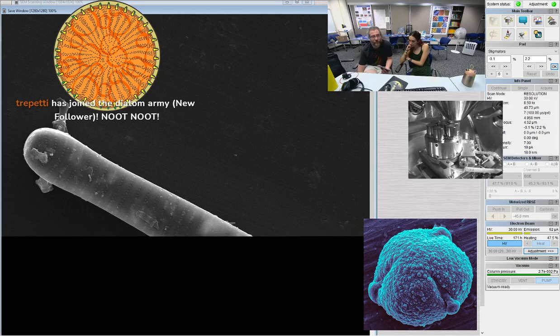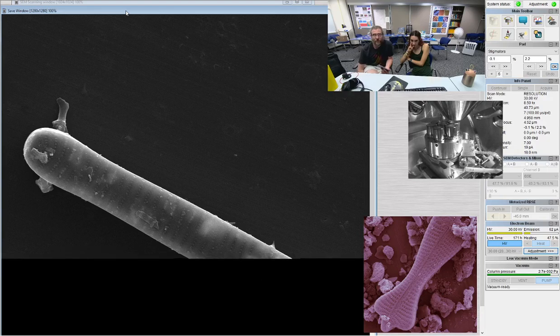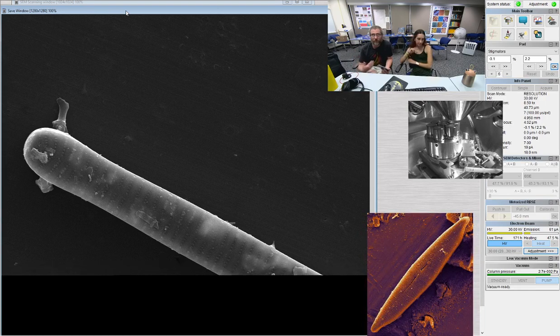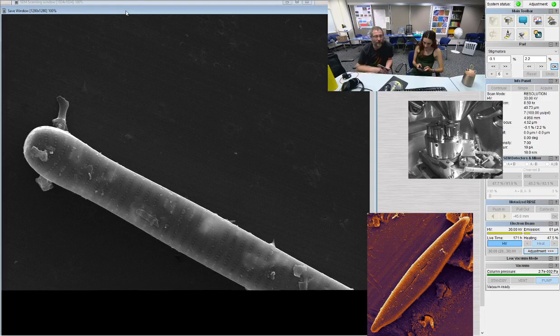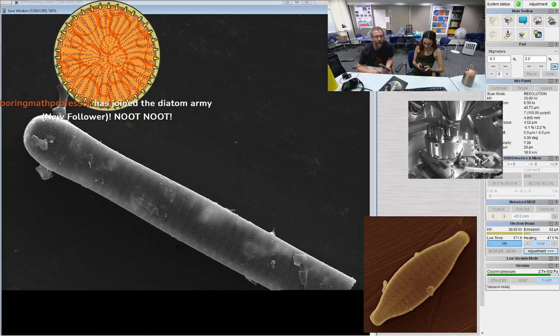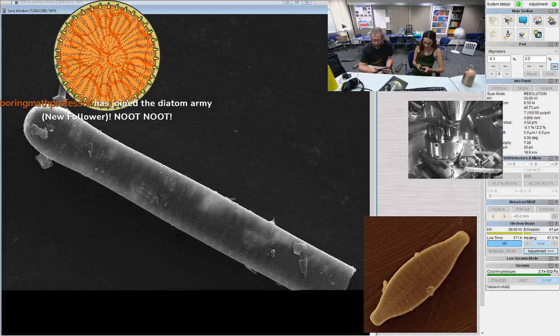and then we've used it for all kinds of things where we want to use analysis of elements. We've had some professional mining people come in. They would look at some thin sections of rocks and use it to try to figure out whether they're looking at samples that might have gold in them or not, or silver. They'd come in and do some analysis on the minerals that were there to see what the mineral suites were and try to use that to figure out how good the deposit is likely to be? Just as some examples.